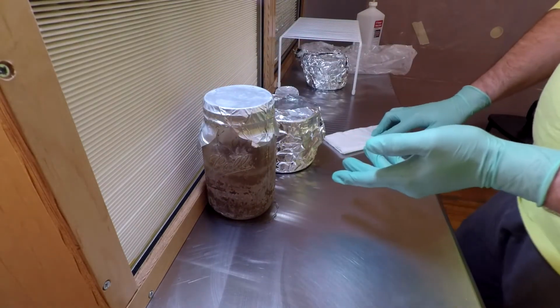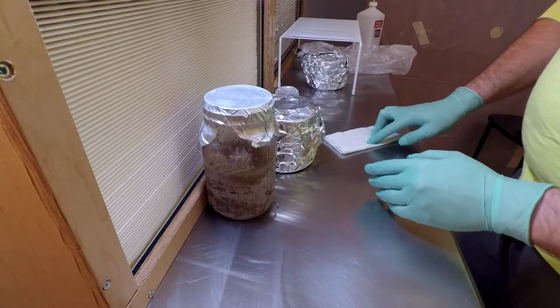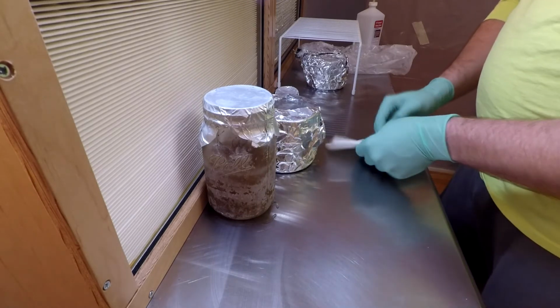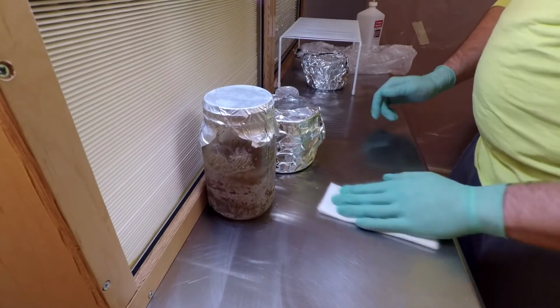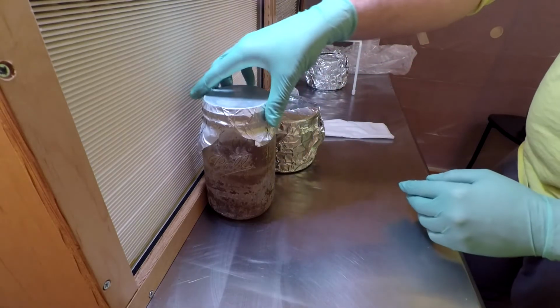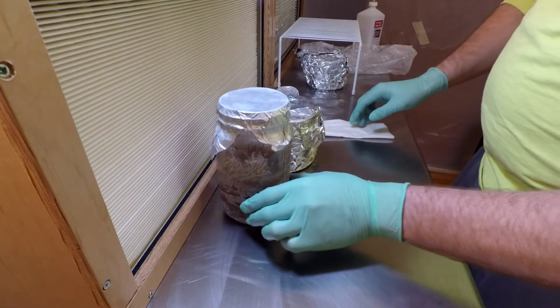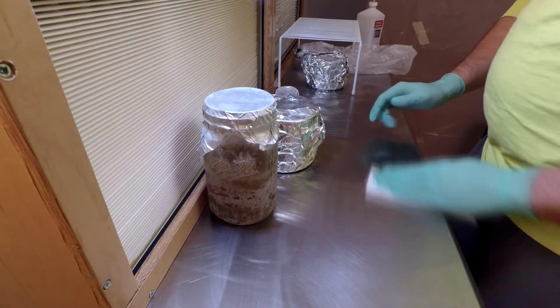And even if your agar does gel, you don't have to throw it out. Just re-pressure cook it again, and it will melt the agar up, and then you can reuse it. As long as you don't over caramelize the agar, you don't want it to turn into like a dark brown. You want it to keep that kind of fleshy tone and color. So as long as you don't overcook it, you can save it.